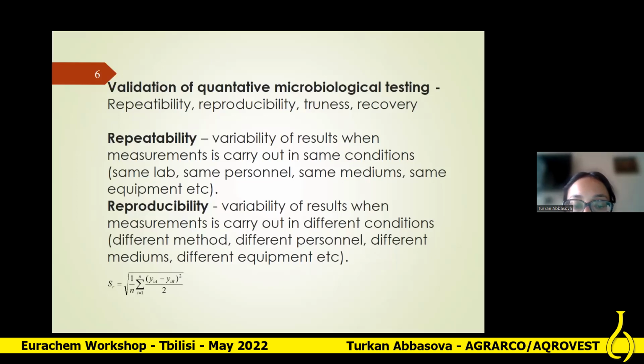The results should be reliable and true, and therefore this type of quality control must be provided in each laboratory that is going to be accredited.